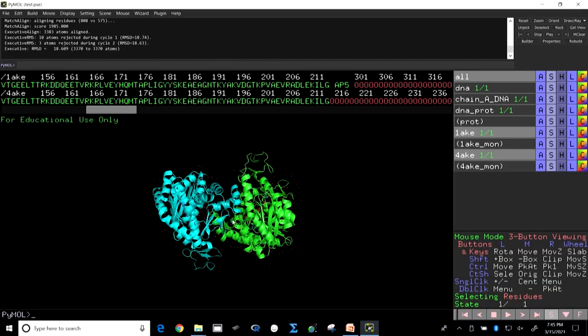The decision comes through a statistical technique which is called root mean square deviation or RMSD. Here you see the RMSD value is calculated for 3370 atoms, the value is 18.